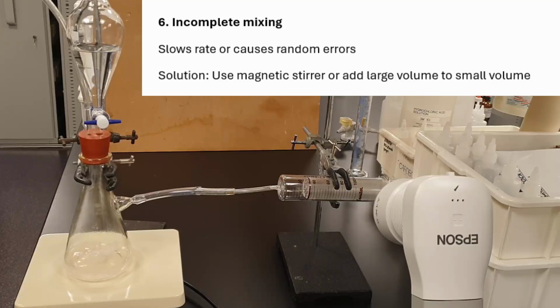And so what you're going to expect there, I didn't do a data run for this, but it'll be a slower rate if the mixing's not as good as it could be. The stirrer mixes it quite well. I can actually get it to spin around the whole base in kind of a mad fashion. I didn't do it here, but I was doing it before. I could have adjusted it. And also I chose to use liquids for more complete mixing rather than a heterogeneous reaction, a solid to liquid like a magnesium solid with acid, or a calcium carbonate or sodium carbonate one with acid. So I went for liquid to help with the mixing.